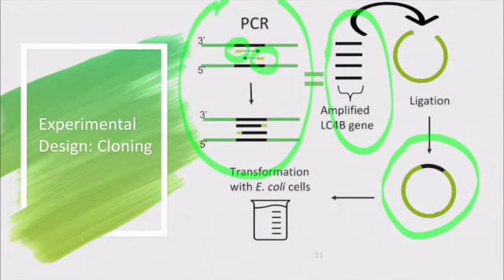Once the gene was inserted, we transformed the plasmid containing our gene into E. coli cells. This process takes advantage of the genetic process of bacterial cells. Amplification of the plasmid occurs in the same way the replication of the bacterial chromosome would replicate. The E. coli cells we used had been modified so they did not contain their own plasmid. This allowed us to transform our plasmid into cells.